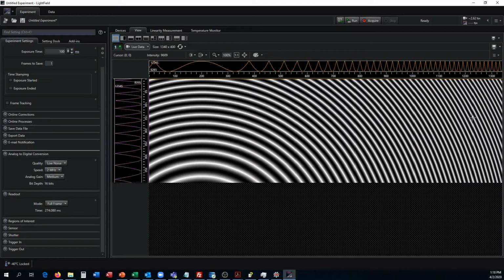I'm going to stop the preview. Just a placeholder to show you that data comes out, and just so you have objects to work with when you program your automation, or you look up things like frame rate, or any other task you'd want to do if you didn't have a live camera handy, but you need to check something out on the camera. So let's just do a simple acquisition really quick.